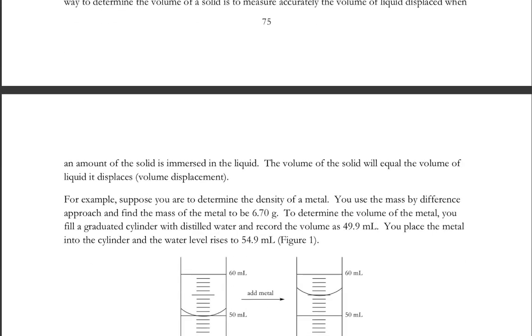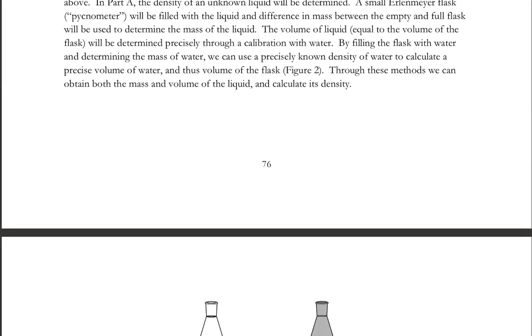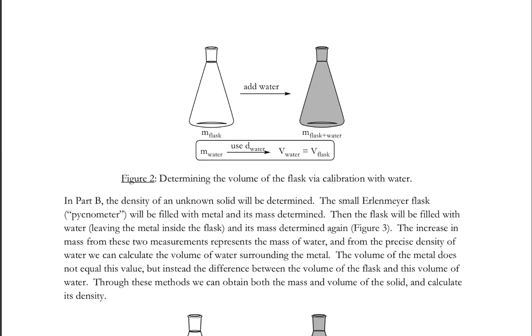In the first part of the experiment, we are working with determining the density of a liquid — a liquid much like gasoline. We are putting it into a flask called a pycnometer. Before we put it in the flask, we will determine the mass of the flask. We will fill it with liquid and then determine the mass of the liquid and flask. The difference is the mass of just the liquid.